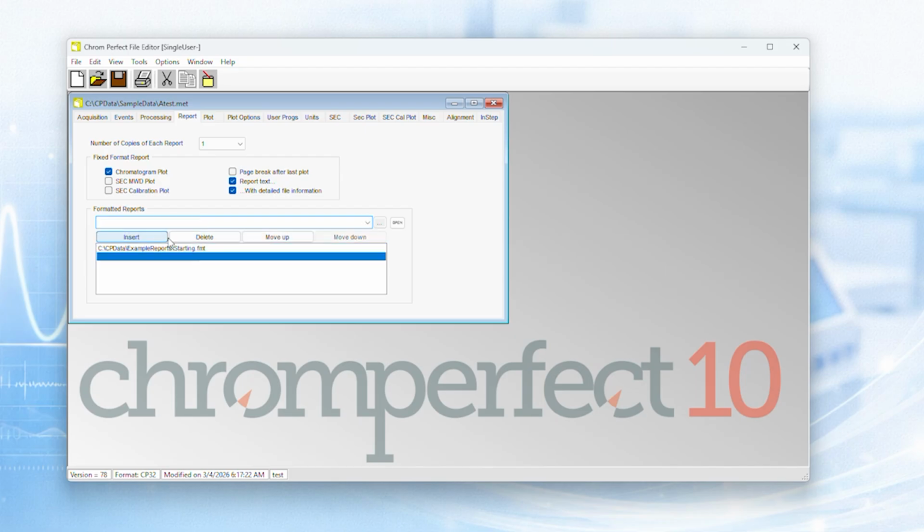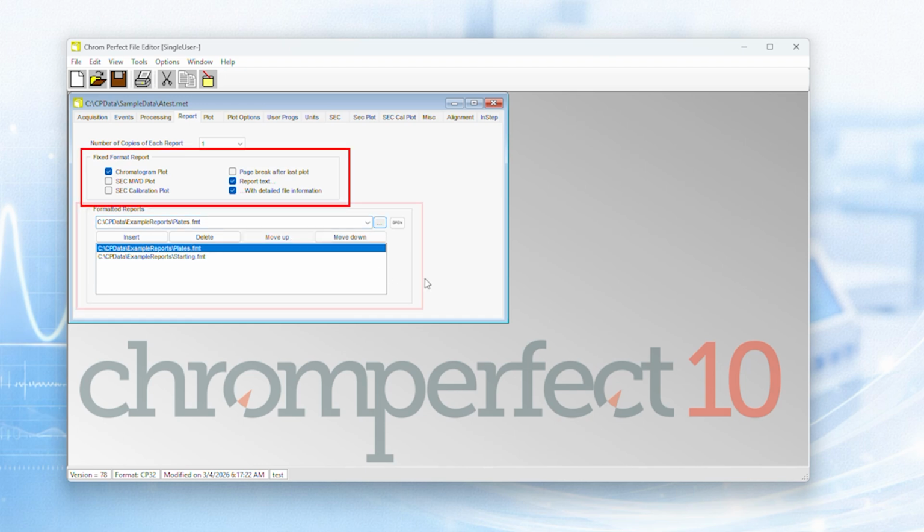Reports do not need to be physical. Chromperfect supports a variety of digital formats to allow automated data transfer to other platforms such as databases or LIMS. You will see options for fixed format reports and formatted reports. Formatted reports can be inserted, removed, and reordered within the method.